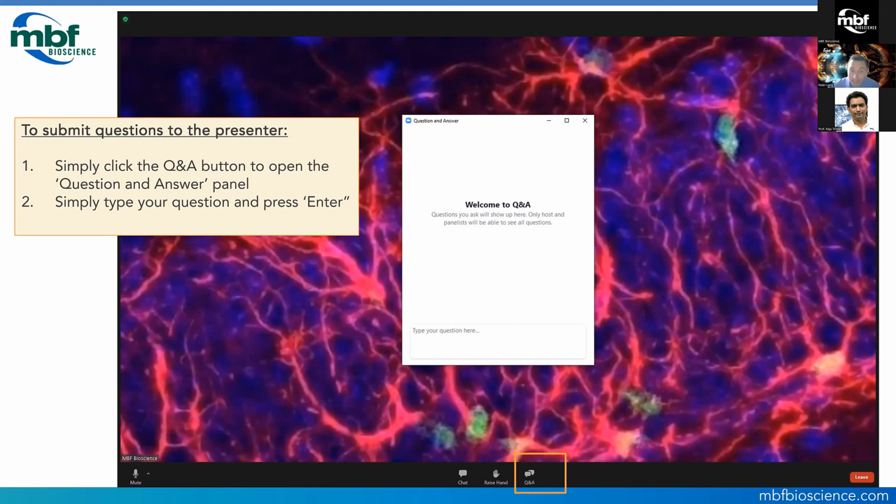Let's see, maybe we've got time for one more question. We are running close to our time limit here. For multi-channel imaging, what are the time costs associated with adding additional channels? Since there is a single detector, I'm assuming each channel must be collected sequentially. Yeah, I guess currently that's the case, right, Peter?